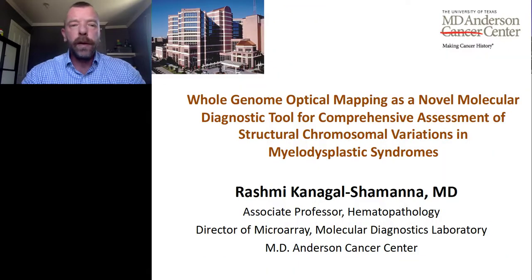And then also at the Cancer Genomics Consortium, Rashmi Kanagal-Shamana from MD Anderson Cancer Center talked about MDS, myelodysplastic syndrome, a precursor of AML. And again, there she looked at a number of samples of a preliminary results of a larger study, and she found just incredible concordance.